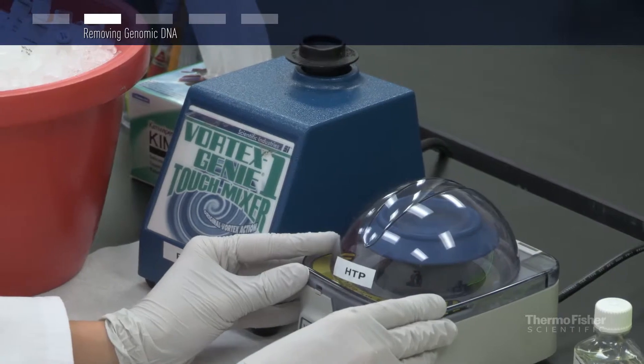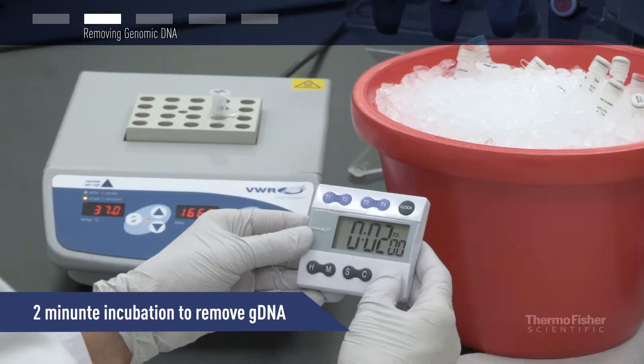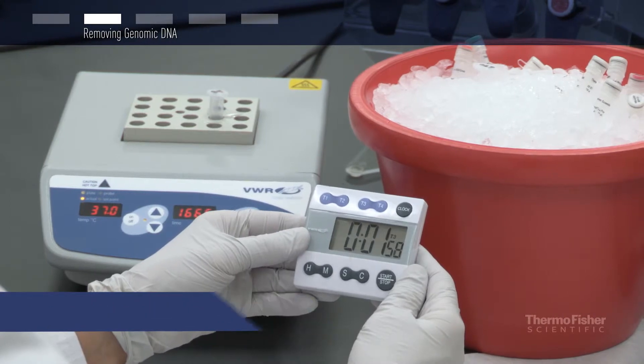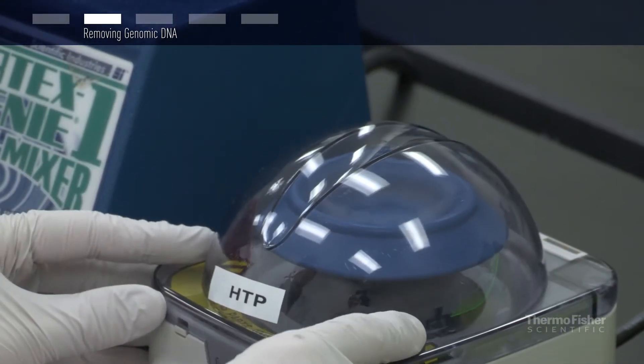Mix gently, pulse spin, and incubate for two minutes at 37 degrees Celsius. After the genomic DNA elimination step, pulse spin and place the tube on ice.